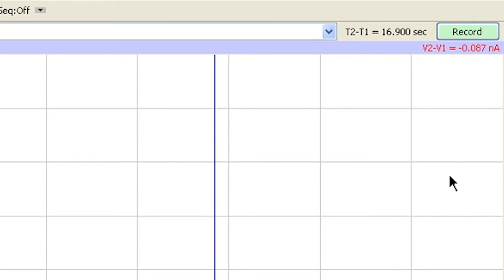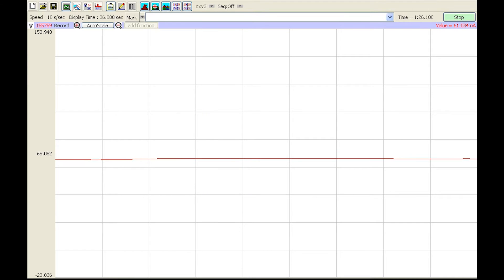To monitor the sensor's polarization, start recording data. After an hour, the recorded data should show a stable baseline between 16 and 80 nanoamps. The polarized sensor is now ready for the next step in preparation.